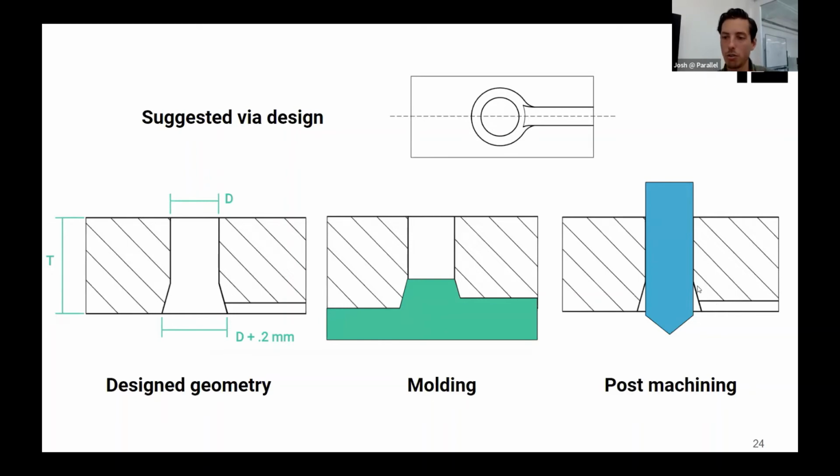And so now, if you do get a burr, the risk of that is, one, already greatly diminished, and two, it's going to happen up in the via where you have a larger diameter hole. And so if there is any kind of burr left behind there, it's much less likely to trap a bubble or to cause obstructions in your flow. And so if you can work with this particular design, it really helps to make the products more robust for you.